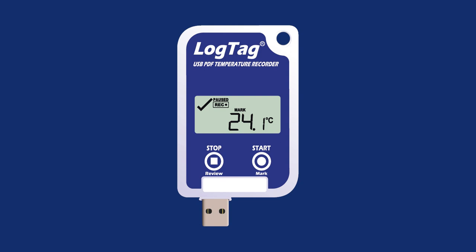At any time, you can review the recorded minimum and maximum temperatures by briefly pressing the Stop Review button. The highest recorded temperature during the trip so far is shown, indicated by max. Pressing Stop Review for a second time will show the lowest recorded temperature during the trip so far, indicated by min. The review screens can be exited at any time by pressing the Start Mark button or by waiting 30 seconds without pressing any button.